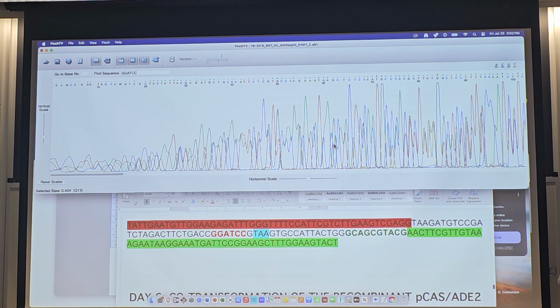Can you find out what the contamination is by just manually looking at the smaller entities? Yeah, we could go through and we could try to pick out that sequence, and I would lose my mind after a while. I've already half lost my mind from trying to read these. You can give it a shot, Bryce. If you want to try to read that, this would be good extra credit for the final exam. You could read that extra sequence underneath there and then BLAST it and tell me what it is. That would be really useful.